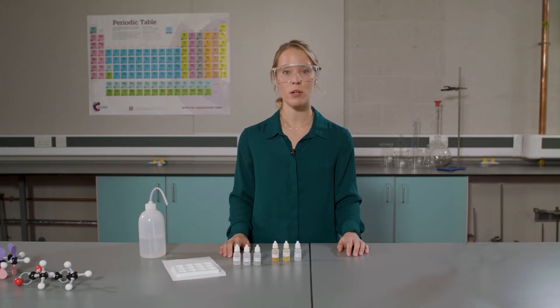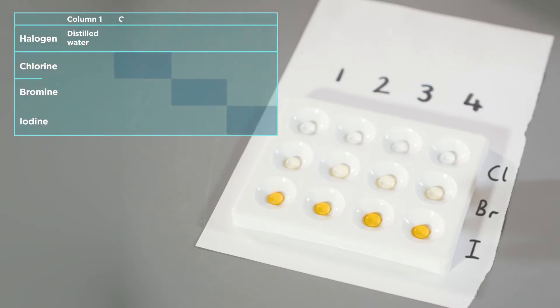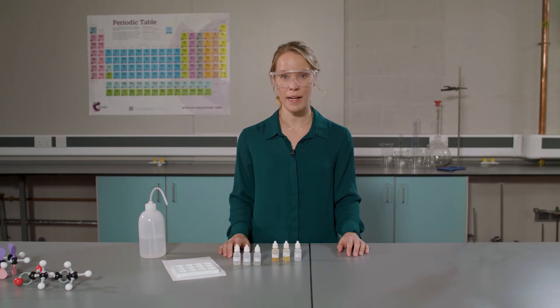It is important to make careful observations and note down any changes in a table. Remember that the colour of chlorine water is described as colourless and not clear. This is because a clear solution is simply one that does not contain any particles in the solid or gaseous state. So the colour of bromine water can be described as clear pale yellow. I'm going to start by adding distilled water to the first column.